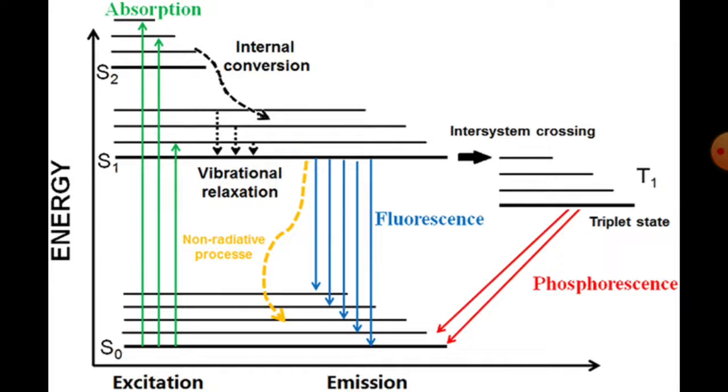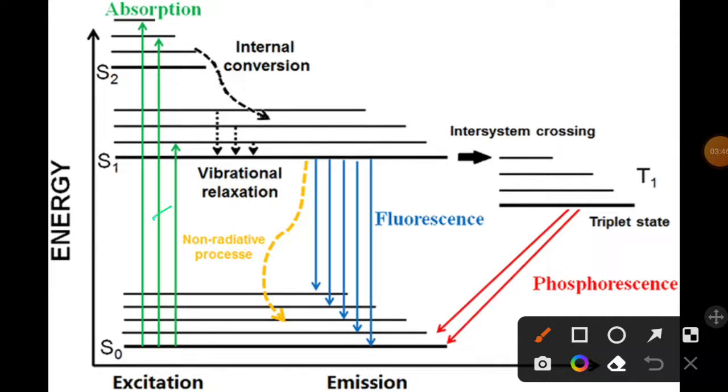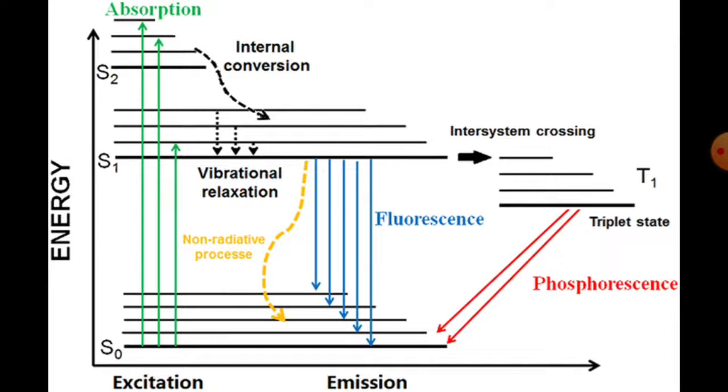Now after the discovery of phase contrast microscopy, scientists started to think that with the first three microscopy techniques we were watching only at the cellular level, that is, just visualizing the nucleus, cytoplasm and so on. So scientists decided to develop something new that would help them distinguish not only the cell, but also various proteins and surface receptor molecules present in the cell. That means from the cellular level, they decided to visualize the protein level of a biological specimen with the help of microscopy. So today we are going to visualize biological samples at the protein level with the help of fluorescence microscopy.